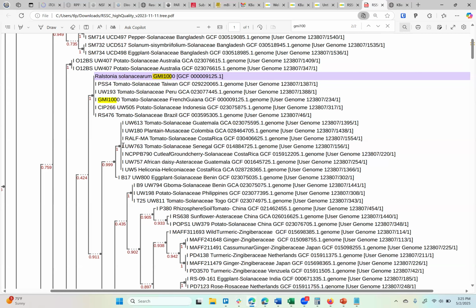For the narrative we maintain, we try to be really consistent about our metadata: phylotype first, then the strain number, strain name, host plant family, isolation country, and then the NCBI accession.